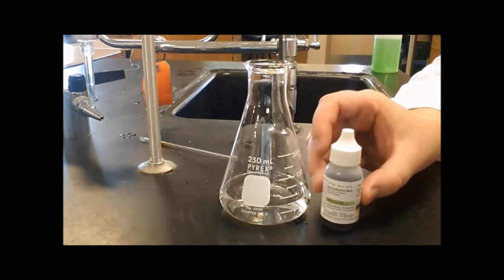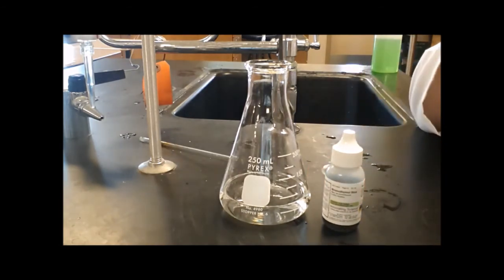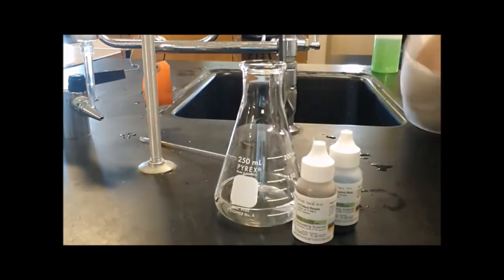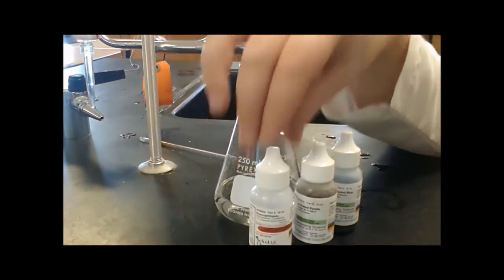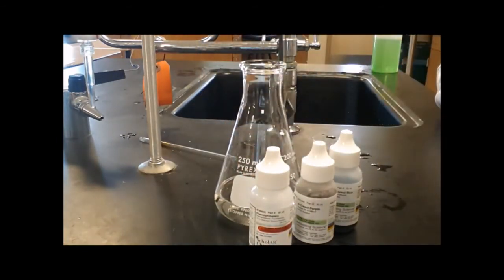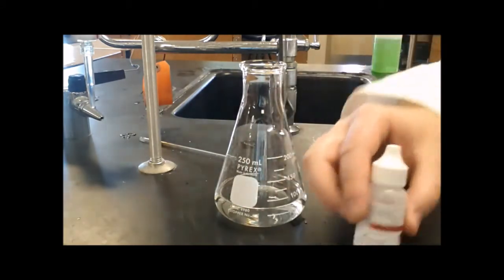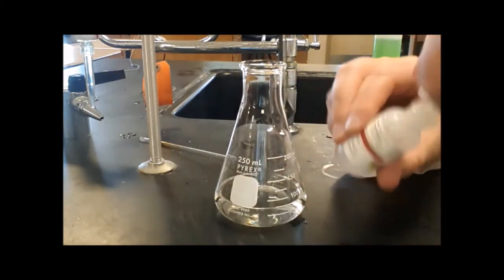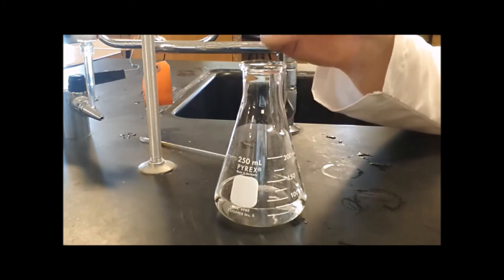So there are many different indicators. For example, we could use bromothymol blue. We could use m-cresol purple. There's tons of them. The favorite of high schools generally is phenolphthalein. Phenolphthalein is nice because it has a very obvious, very clear endpoint. The color change is not ambiguous at all. So we'll use phenolphthalein. It doesn't take more than a couple of drops. So we'll just add maybe 1, 2, 3. That's probably 2 drops more than we really needed.